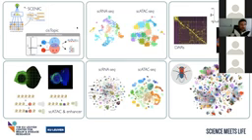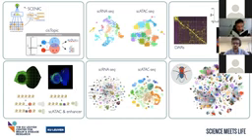I hope, I think it was fast. I tried to put quite some information here, but in half an hour, it's not so easy to explain all the methods. I hope you still get some ideas about SCENIC and cisTopic. I explained to you how we combined RNA and ATAC-seq at single cell level in the eye-antennal disc, how we could find motifs of transcription factors in the differentially accessible regions of each cell type, and that many of them are enhancers. And the same we did on the brain. And then I showed you very briefly a vignette on the Fly Cell Atlas.